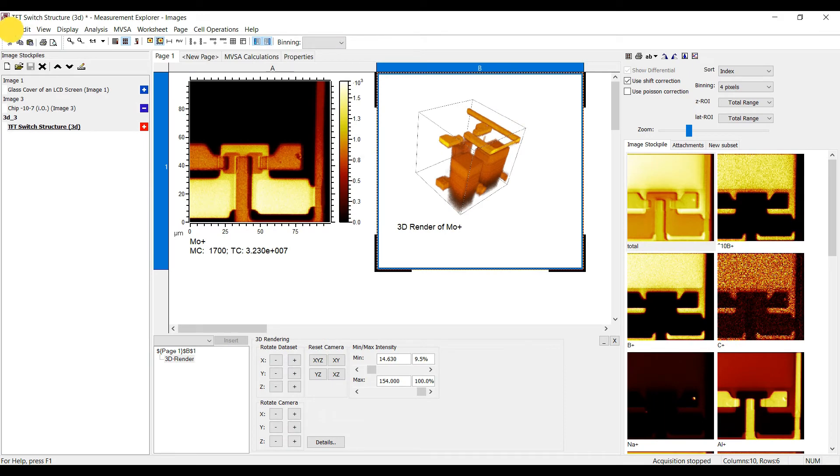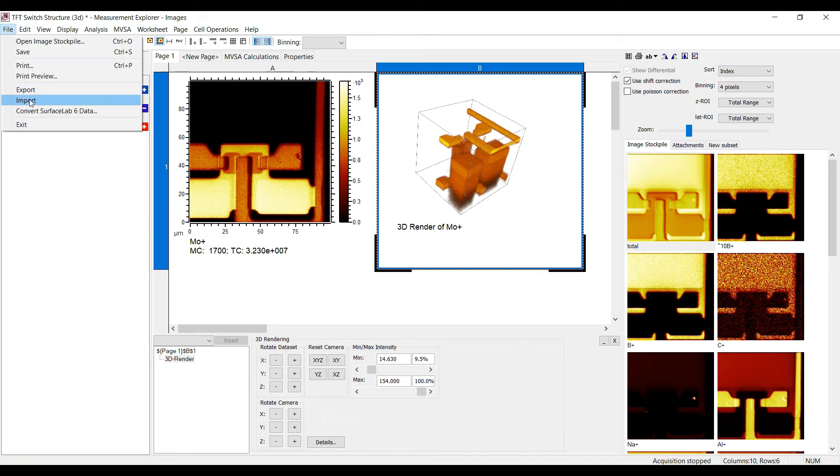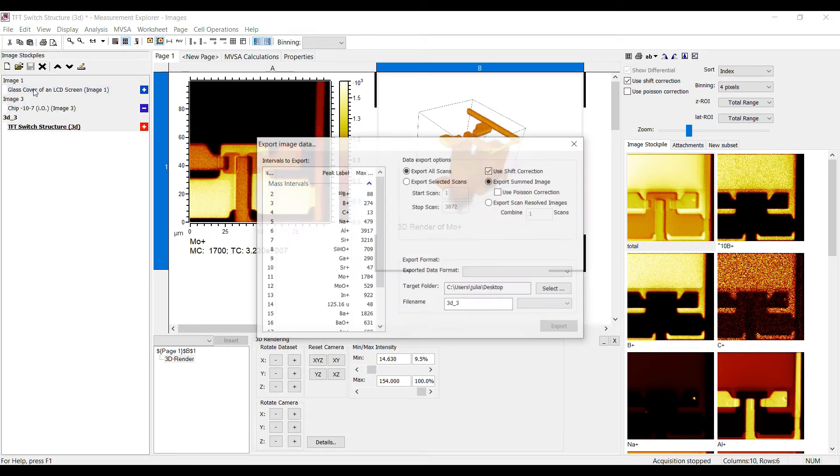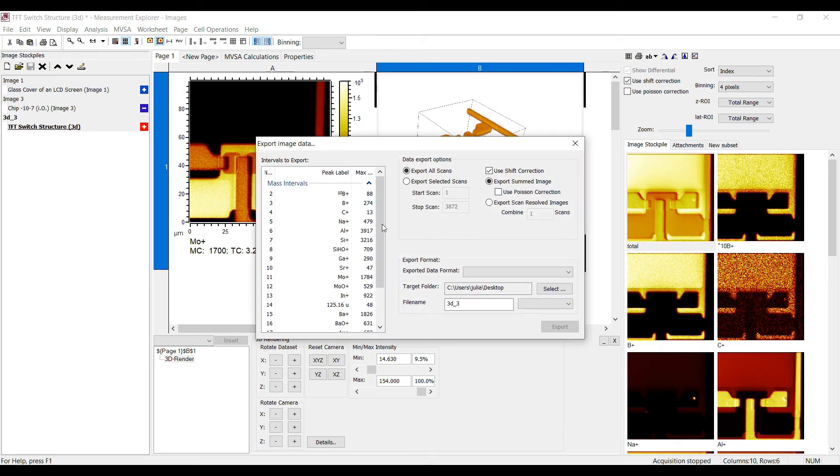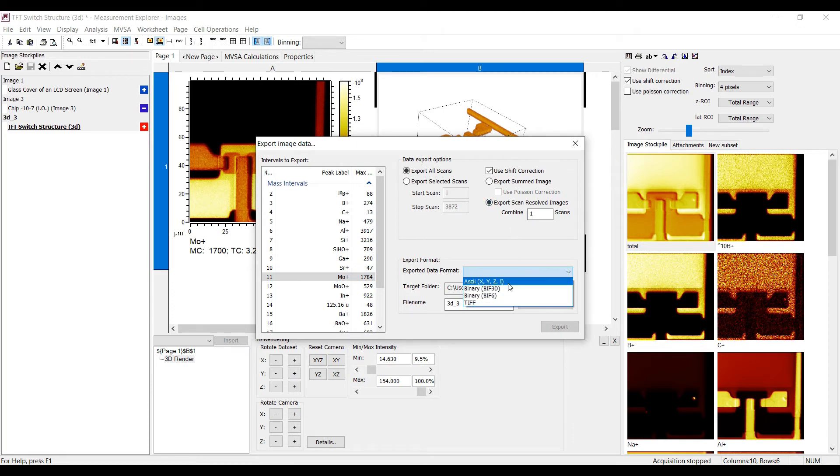If you select Export Scan Resolved Image, you can export 3D data for each mass interval into an ASCII file containing the coordinates x, y, z and the intensity.